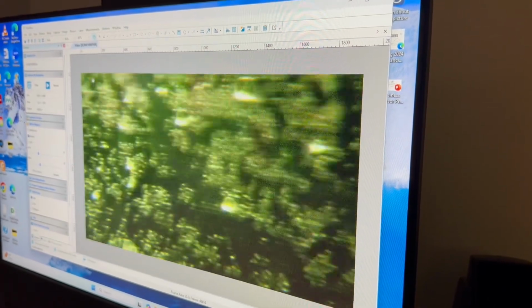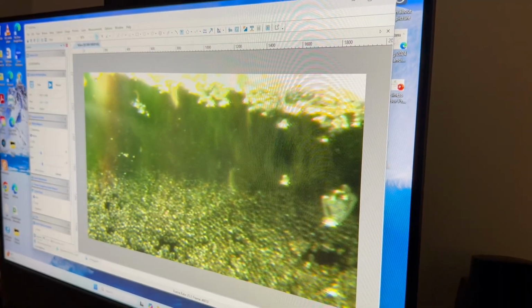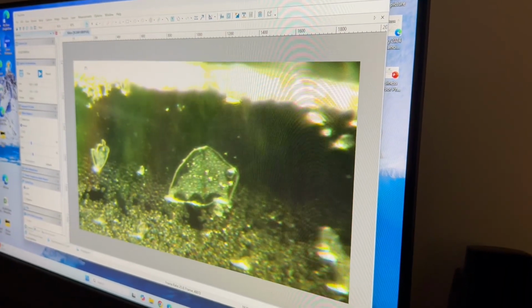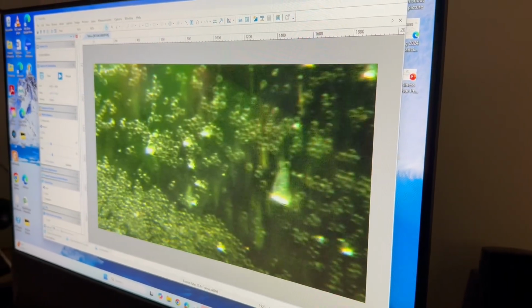Now, if I had parasites in my system, would that show up here? I could see them. Yeah, I've seen parasites. What would they look like? You could actually follow it, think of a worm in a way. Like a thread or something? Yeah, exactly. And you could actually see, on one side, sometimes you can see a mouth.